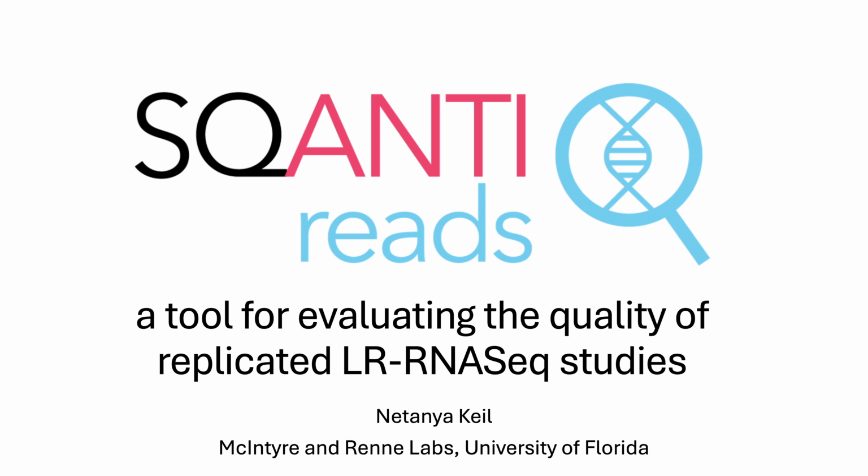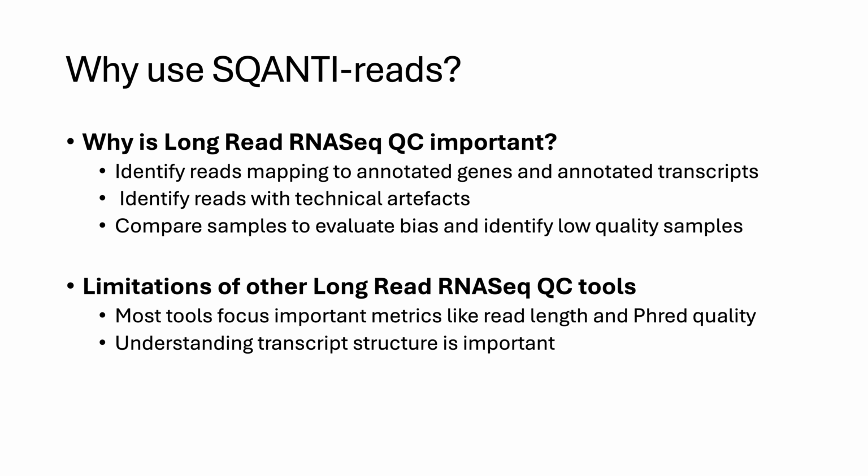Today I'm going to introduce you to SQANTI-reads, a tool we developed for evaluating the quality of replicated long-read RNA-Seq studies. This project was done in close collaboration with the Canessa Lab. Over the course of this tutorial, I'll walk you through what SQANTI-reads does, how to run it, and how to interpret the results.